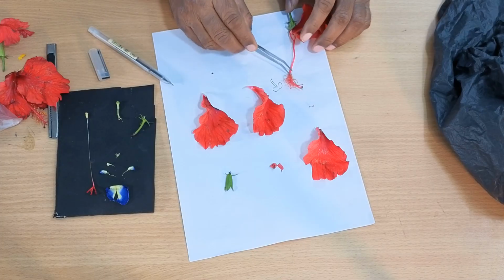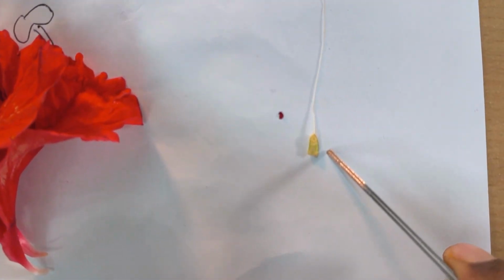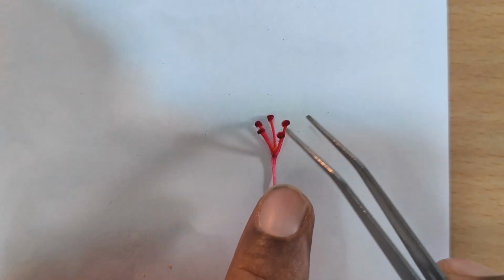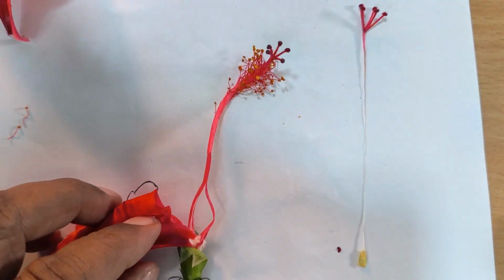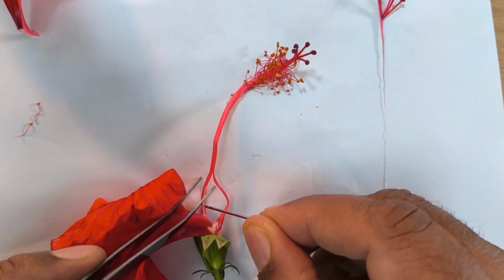So all the filaments are joined to form a staminal tube. That staminal tube is attached with the petals at the bottom, so it is called epipetalous. Now, for your benefit, I have just made this. This is the ovary, and then this is the style, and finally you find five stigmas, and the stigma is capitate. This is the staminal tube. Inside the staminal tube, you can find, see, I am slowly teasing it.